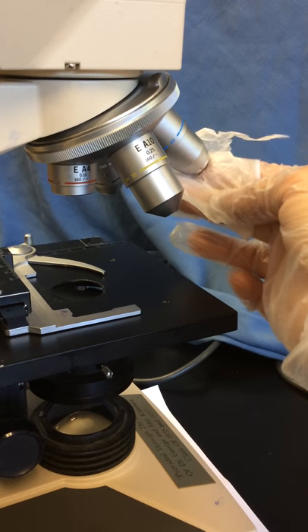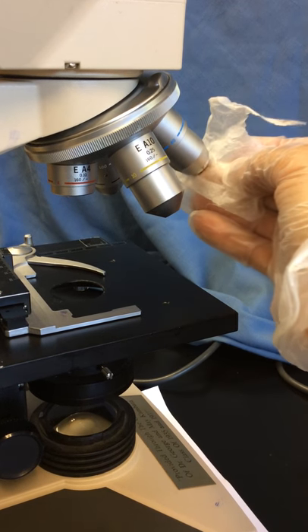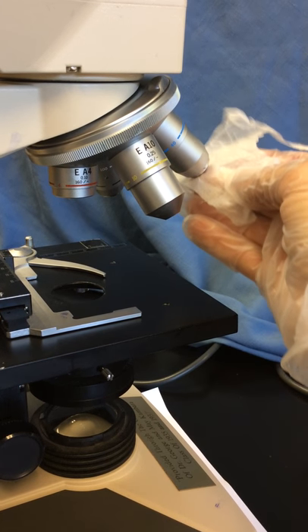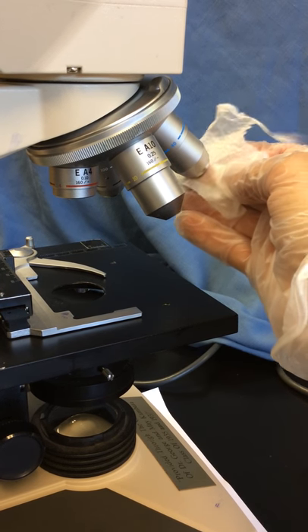Many of the microscopes, you'll notice that the high dry lens appears cloudy, and that's because by accident, immersion oil has dried on the lens and now the image is very cloudy.